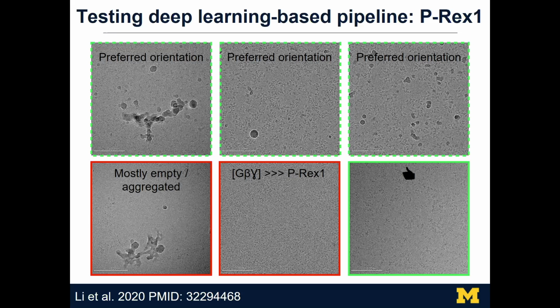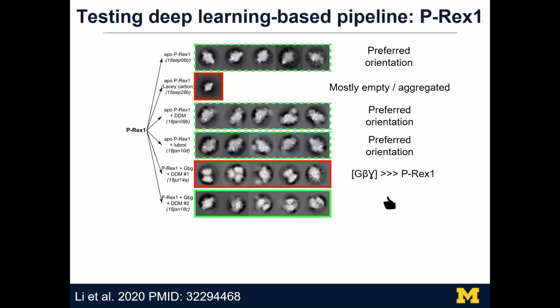And we run the pipeline on these 6 different data sets. It takes micrographs in the pipeline and gives class averages out without any user input. The class averages are used as evaluation and also diagnosis for the data quality. So basically, this is the output. This is the result of this data screening case study.